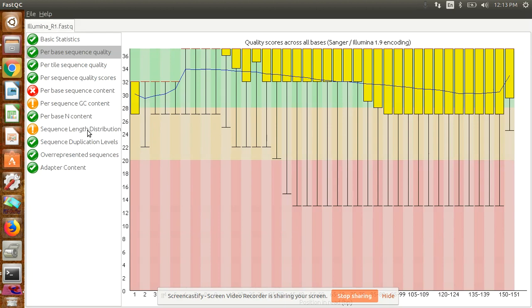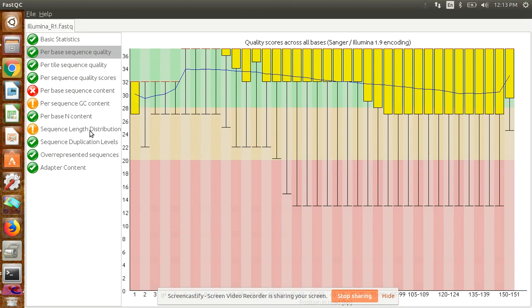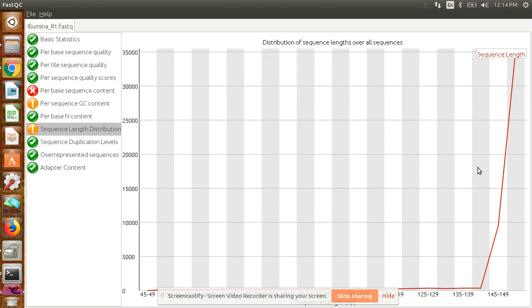You can go to the length distribution. If your sequence is 150, most of the sequences would fall in this region. Later on, when you go for trimming of your data, you can select the sequences you want to take and set a parameter—suppose 100 base pairs. Less than that, whatever sequences are there, you can discard.